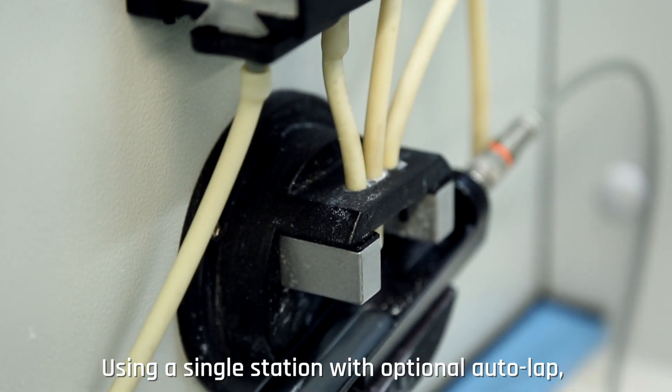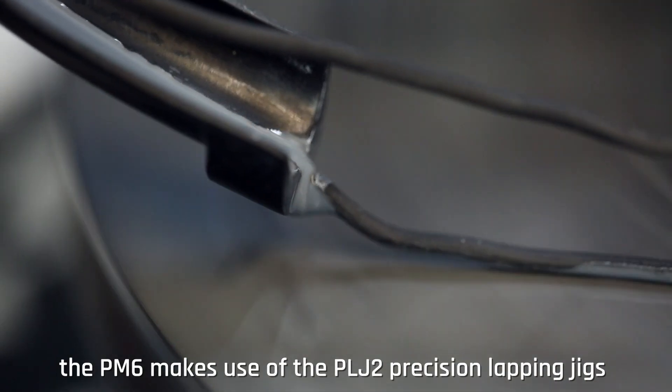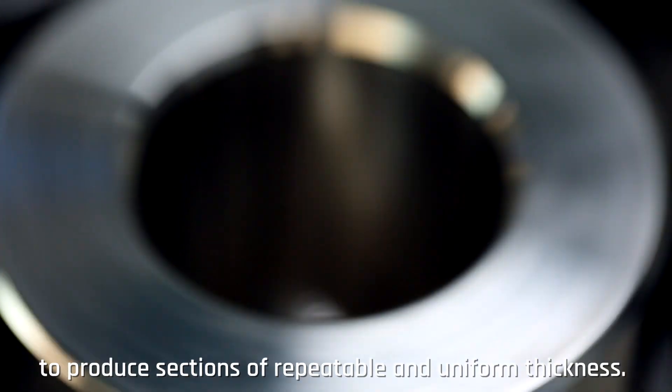Using a single station with optional autolap, the PM6 makes use of the PLJ2 Precision Lapping Jigs to produce sections of repeatable and uniform thickness.